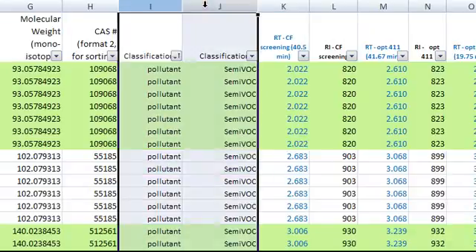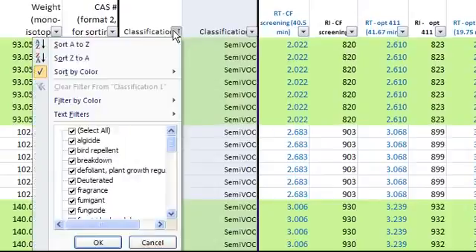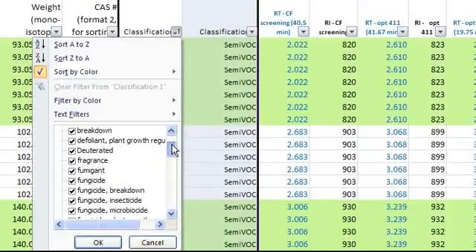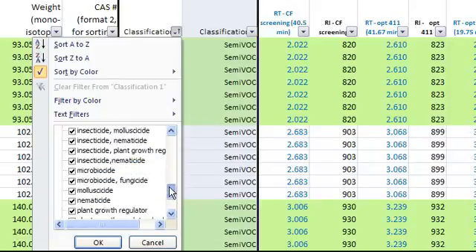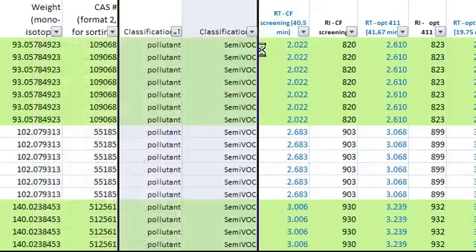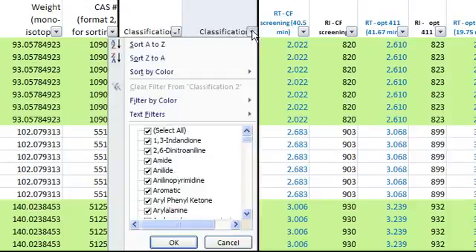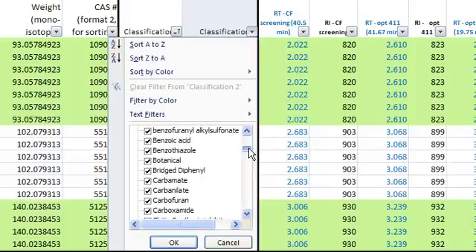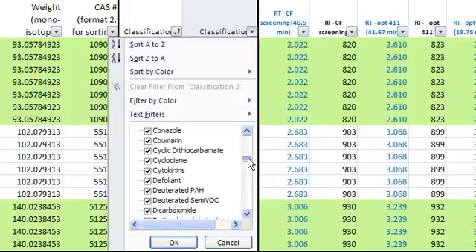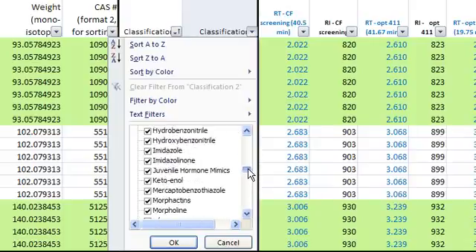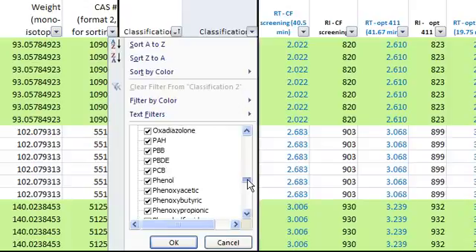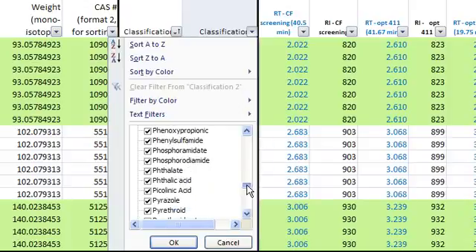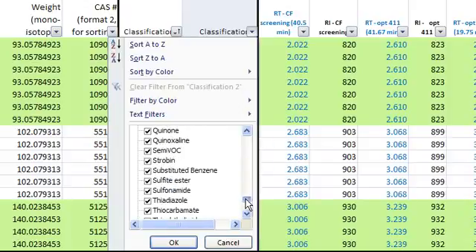The next two columns are the classifications of each compound. Here are some examples in classification 1: Fungicide, herbicide, pollutant. And here are some examples in classification 2: Benzamide, fumigant, PCB, semi-volatile.